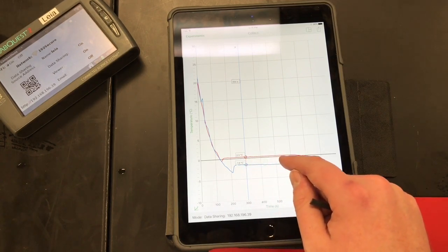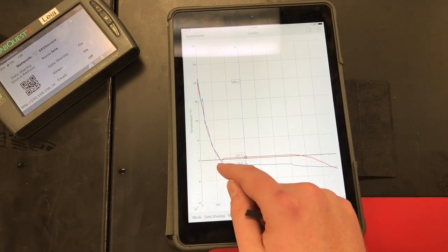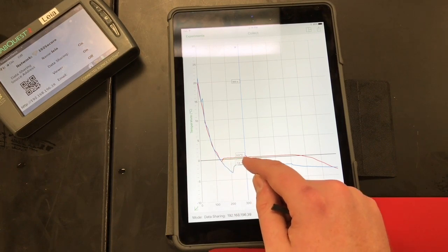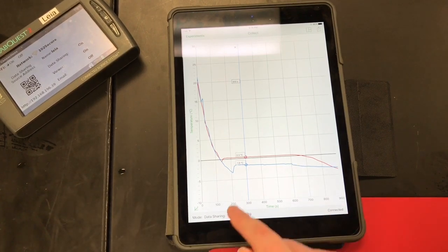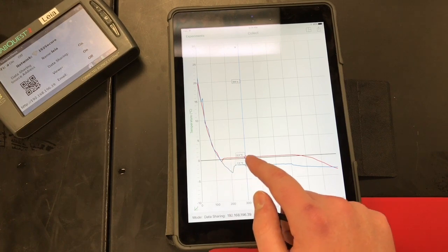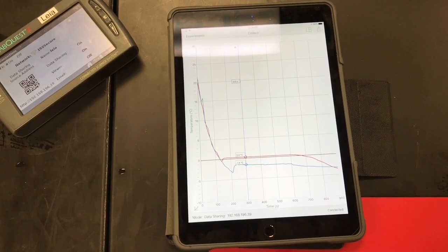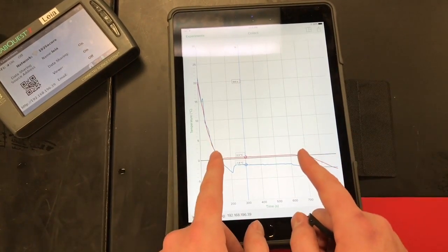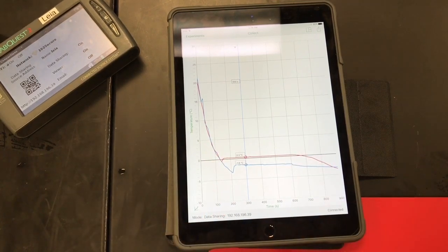Your freezing point, for example the fresh water, is going to be right around 0.3 degrees Celsius. It's when your data stabilizes. So we undergo this freezing point depression, and during this whole time that the fresh water remains stable, it's undergoing the process of freezing. When matter changes state, during this whole time it takes to change from liquid water to solid ice, the temperature should be fairly stable.